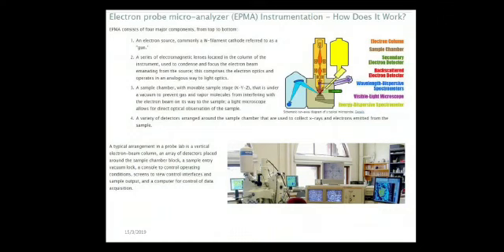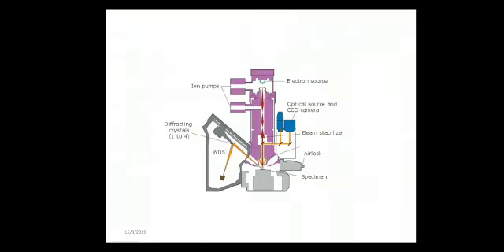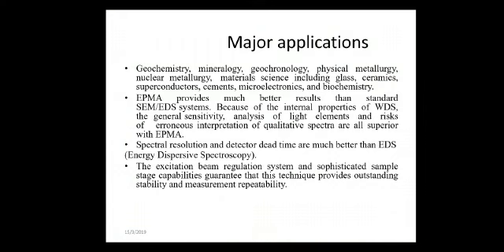In geological applications, we are using this electron probe microanalyzer. It is also used widely for the analysis of synthetic materials such as optical wafers, thin films, microcircuits, semiconductors, and superconducting ceramics. Now some advantages and disadvantages, also known as strengths and limitations, of electron probe microanalyzers.